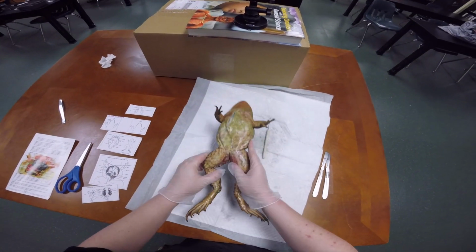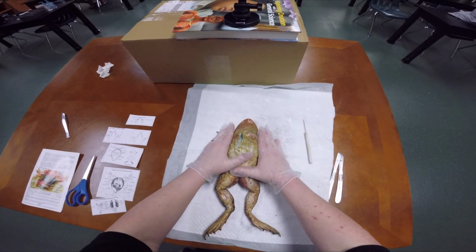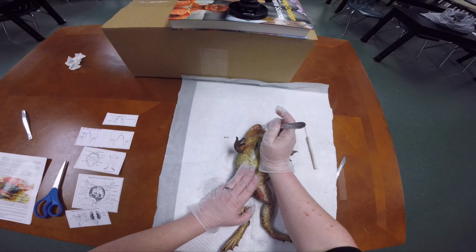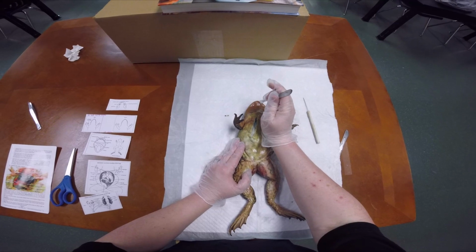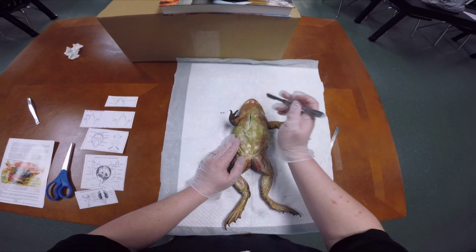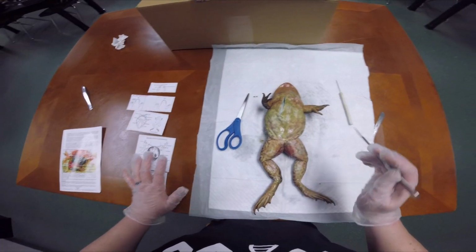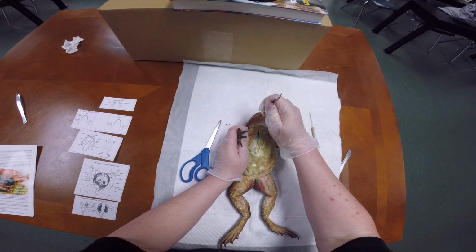Okay, so now we're going to officially flip him over. As you can see, the arms are kind of in the way, so we'll see how that goes in a second. Then you're going to take your scalpel and find the lip, and make a cut, as centered as you can. You're going to make a cut from the lip all the way down to the cloaca. I'm going to make this first cut with my scalpel, and then I may need to bring in these guys depending on how tough this one is to get. So I'm going to start a cut right here.